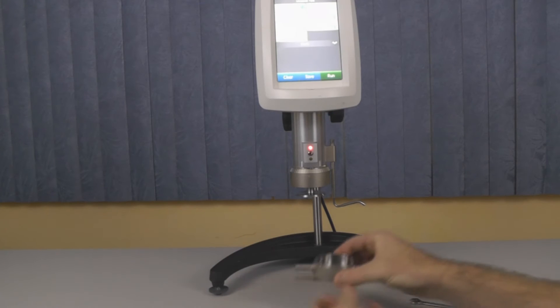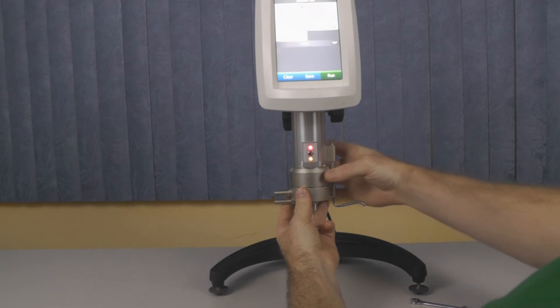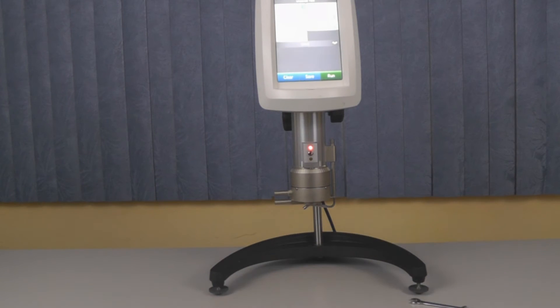If the yellow contact light appears, do not secure the tension bar. This means the spindle is already touching the sample cup and you must turn the micrometer clockwise until there is a space between the spindle and the cup. Once the spindle and cup lose contact, the yellow light will turn off.